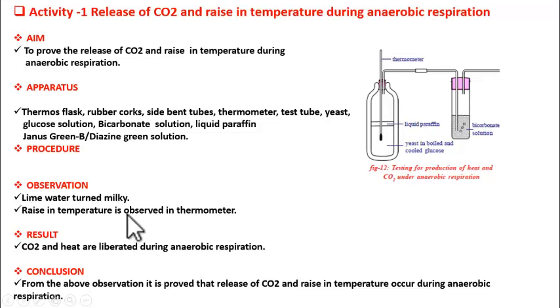So what is the result then? Carbon dioxide and heat are liberated during anaerobic respiration. So from this we can conclude that release of carbon dioxide and rise in temperature occur during anaerobic respiration. Got it, students?